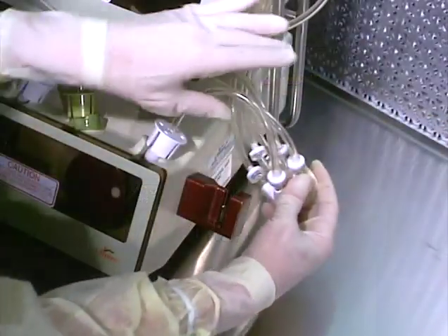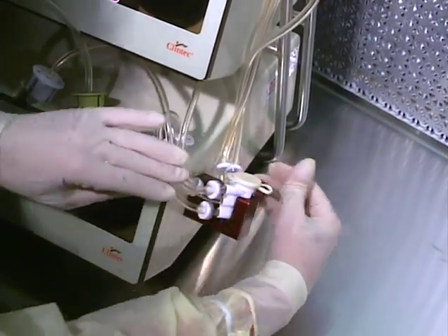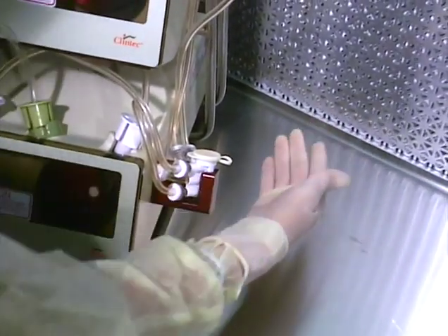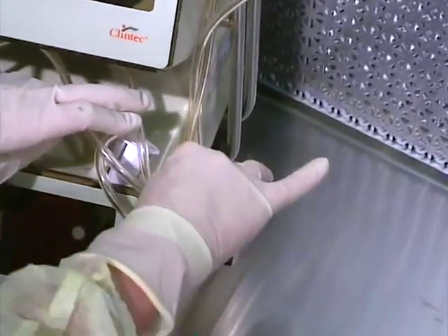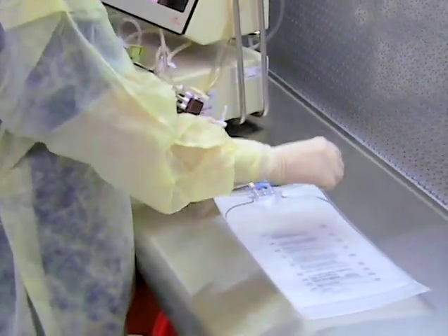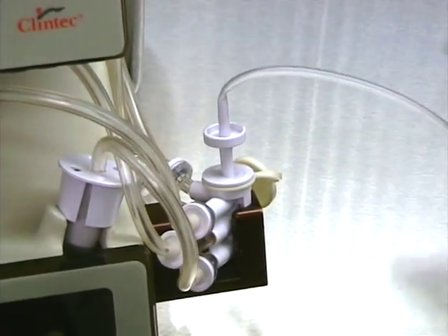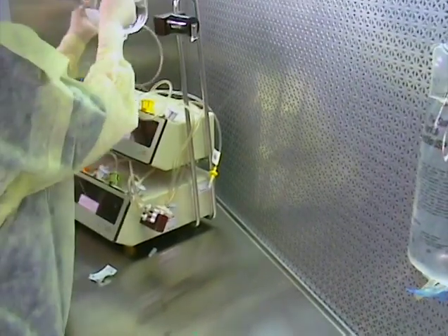Because the final bag connection port is often located in a position that does not facilitate flow of first air to this critical orifice, it is imperative that the compounder be properly oriented to maximize first air flow over the connection port. The connection port should be closed whenever a bag is not connected, and the operator must exercise extreme care when attaching and removing all bags and connections. It is also essential that the source bag spikes be kept in first air when changing source bags and bottles.